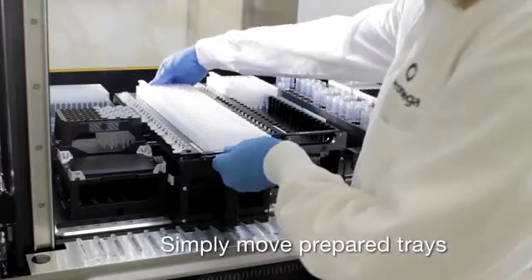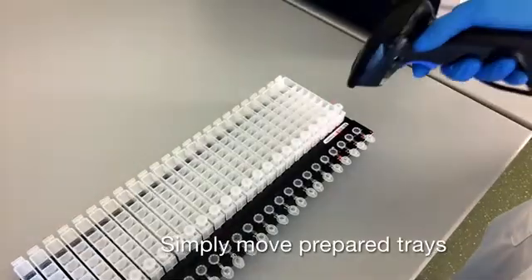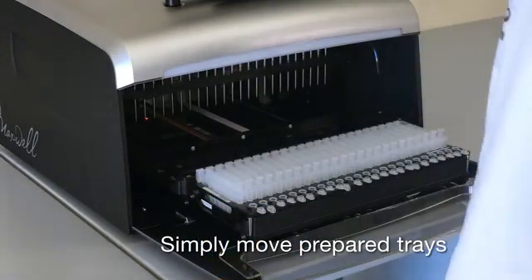Portal software records sample tracking information associated with the trays processed on the MaxPrep Liquid Handler and automatically passes this information to the Maxwell instrument when the tray barcodes are scanned.